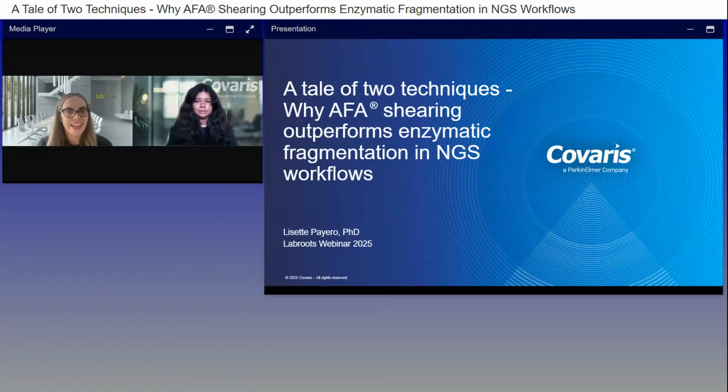It looks like we have one final question here. And this one says, can AFA be used for proteomics? Oh, yes. So that's also a fantastic question. The scope of this talk today really focused on DNA shearing, and I was also able to touch just very briefly on nucleic acid extraction. But we do also offer proteomics solutions and proteomics workflows.